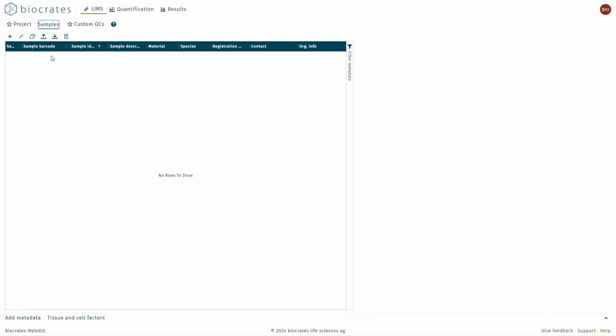Samples are unique database entries that you plan to analyze on a kit plate. These include kit-specific samples like calibration standards and quality controls, as well as your own experimental study samples. While the kit-specific samples are already registered in the database, before creating a work list, the study samples to be included in the plate layout must first be registered into the database. Samples can either be registered individually, which is suitable for small projects or adding an extra sample, or batch imported, which is useful for full kits or larger studies.